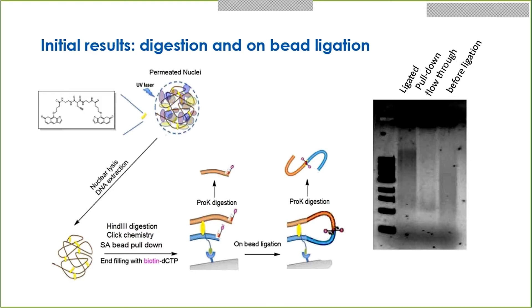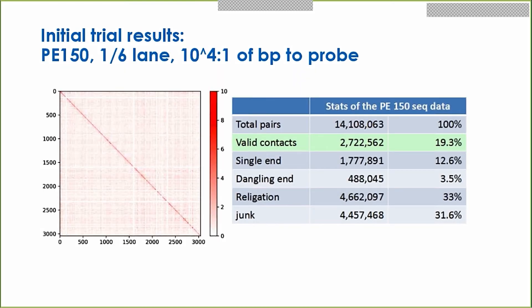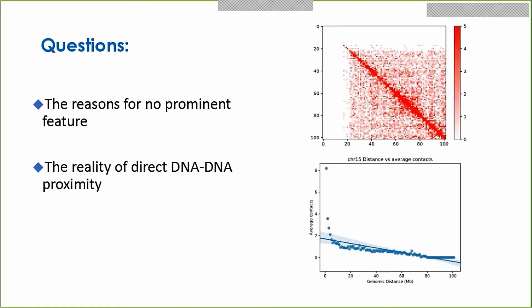We prepared the library and submitted our results for initial, not very deep sequencing. As you can see, the map looks very different from a Hi-C map — it does not have the prominent features often seen in Hi-C. We have 2 million valid contacts, accounting for about 20%. We then considered the reasons for the lack of prominent features: possibly our probe is too short, the probe-to-DNA ratio is not optimal, the shearing procedure introduced junk or re-ligation contamination, or there is random ligation on the beads.